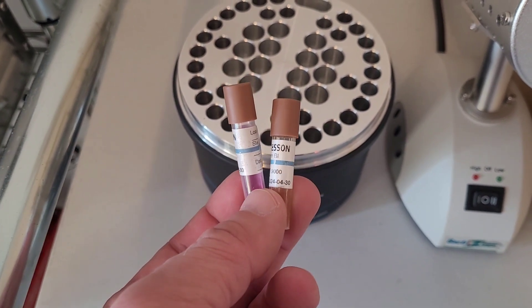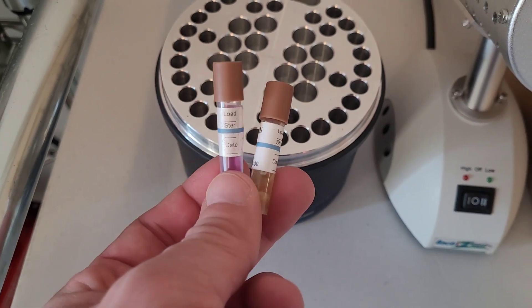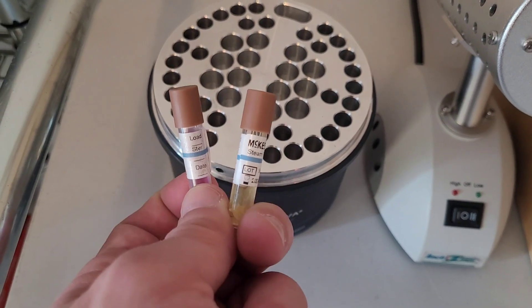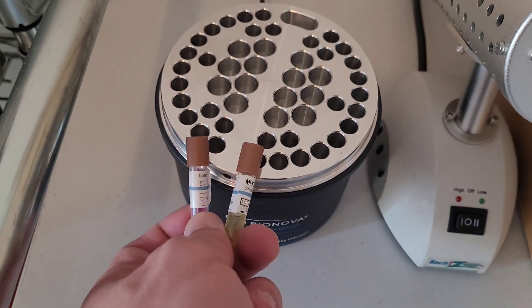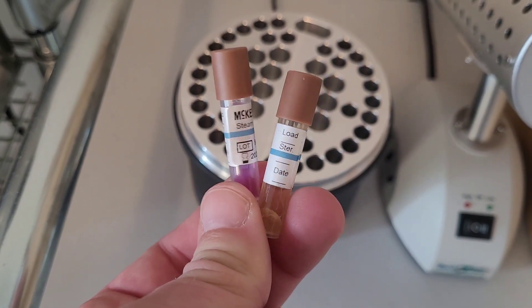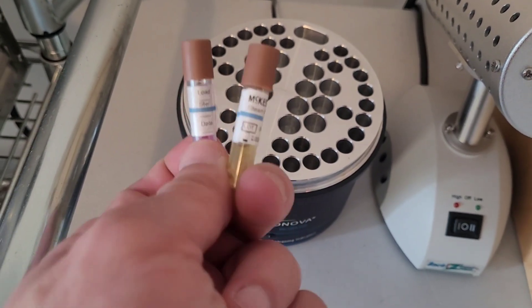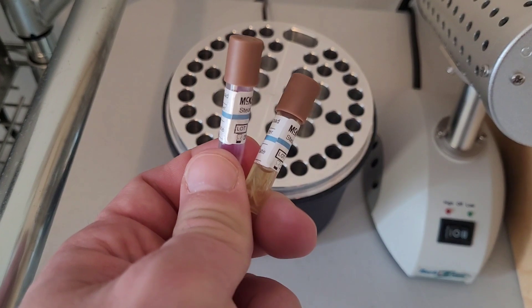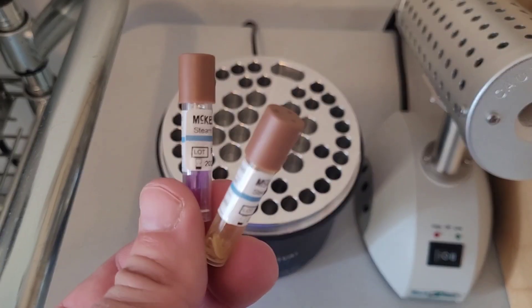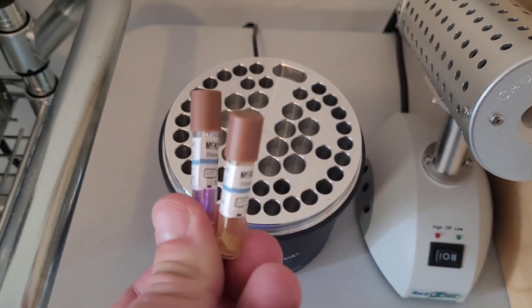When cycling biological indicators, one indicator is meant to be buried centrally inside whatever load you are testing in your autoclave or steam sterilizer, and a second one serves as a control to ensure your incubator is actually working. Notice the chem strips on the control have no color change, indicating they were not steam sterilized. Expect your control to always remain blue, where the cycled ampule should be black on the exterior and hopefully remains purple inside — otherwise you've failed your sterilization test.